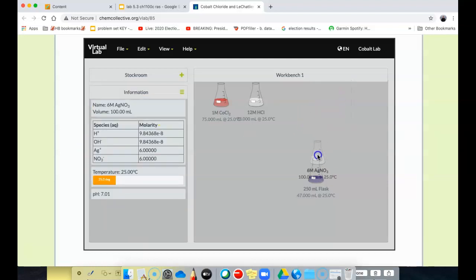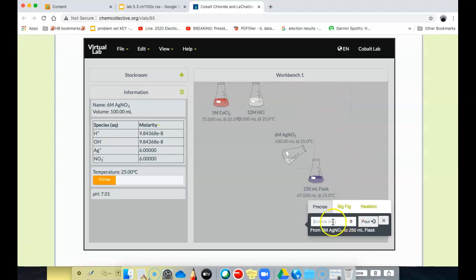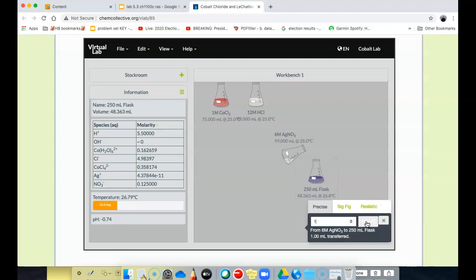And let's add it in 1 mil at a time. So 1 mil, pour. So it went up from 47 to 48. That's 1 mil, 2 mils, 3 mils, 4 mils. Keep going. We should get a change in color sooner or later.